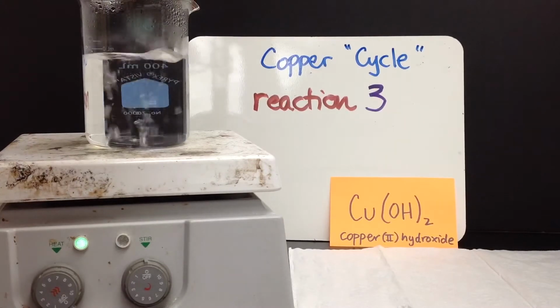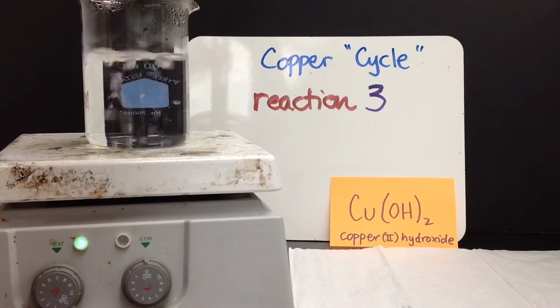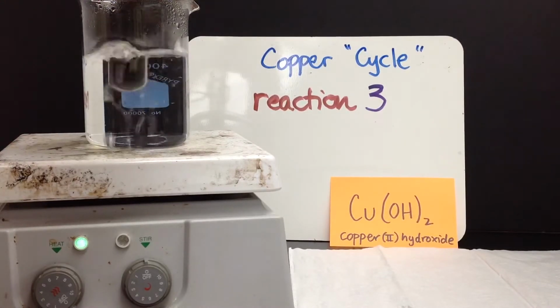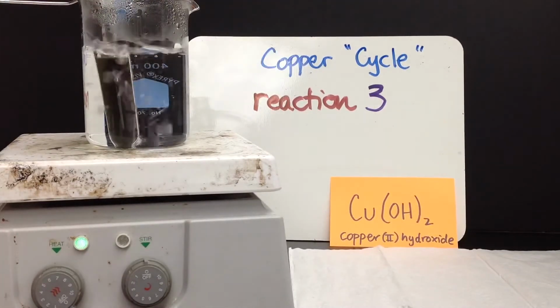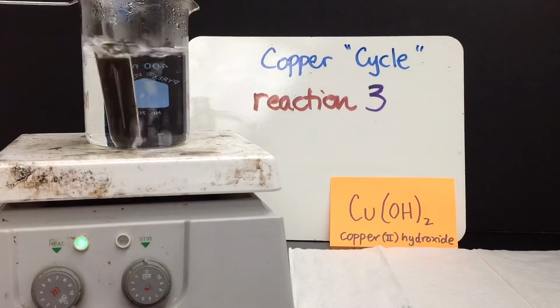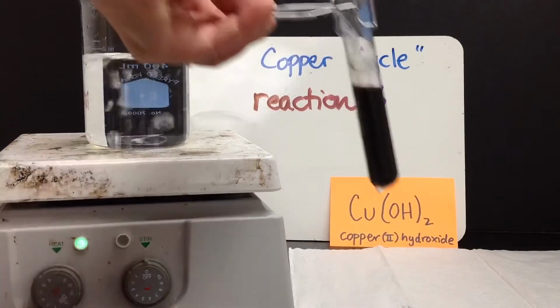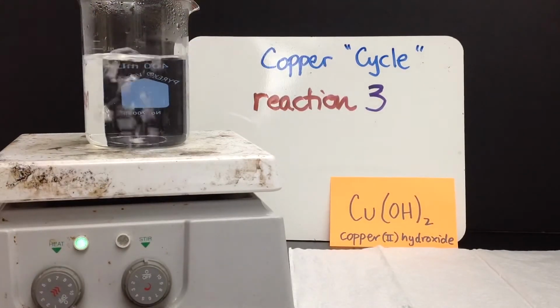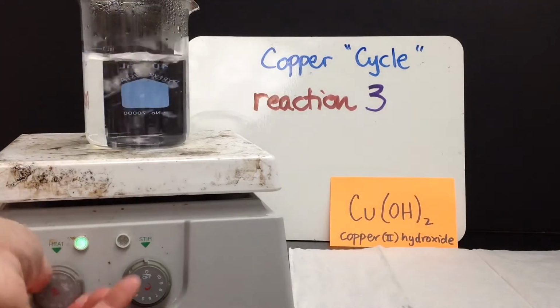And this test tube is full of all kinds of this black substance, and it is opaque. You can't see through it, and that implies that we have solid material there. And I'm going to pull it out of that hot water bath so we can see that a little bit better. Solid material there. So the question is, what is it? Let me put it back into the test tube rack, and I'll get rid of the hot bath in just a second.